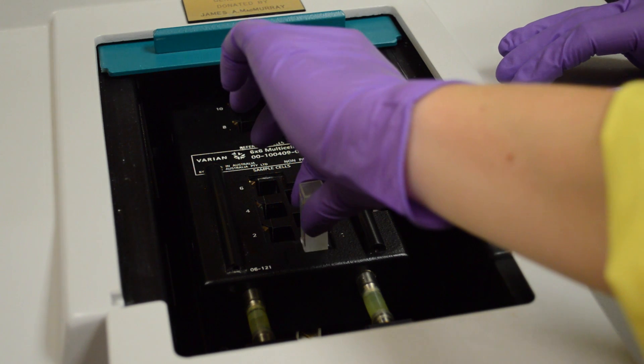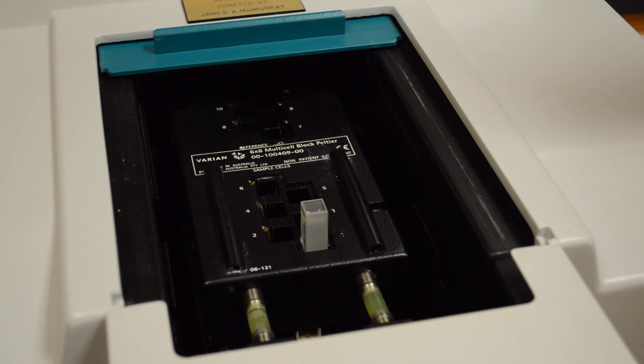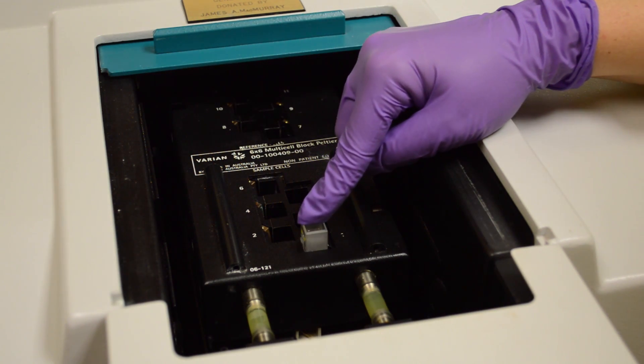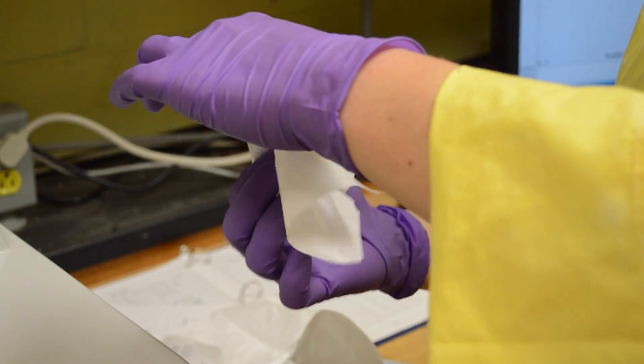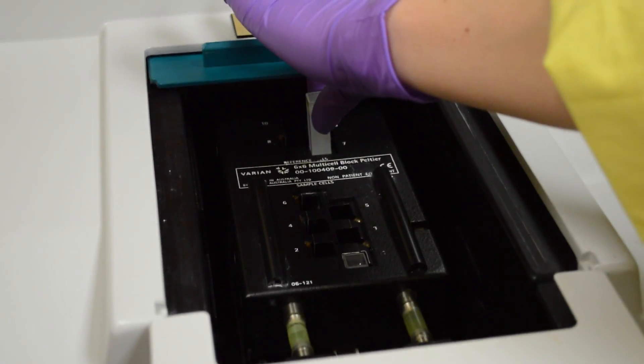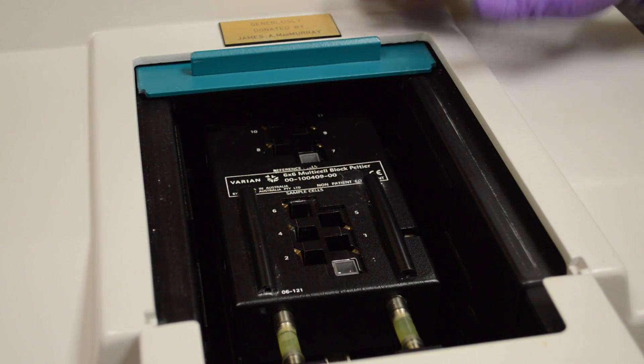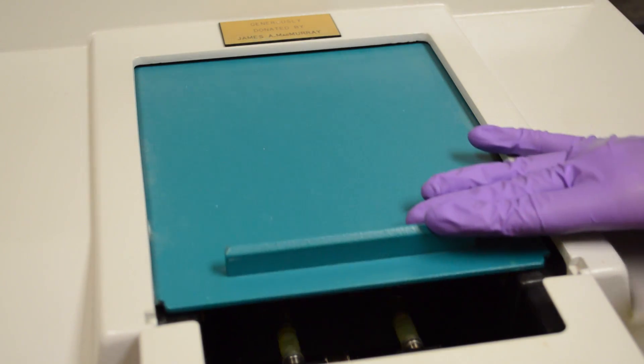You're going to put the cuvette into the spectrometer with the clear sides facing horizontally and you're going to put one in number one and push it down all the way. You're going to put the second cuvette in number seven and push it all the way down. Then from here we just close the lid on the UV-vis spectrometer.